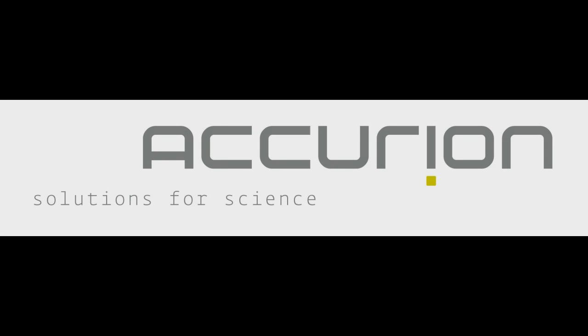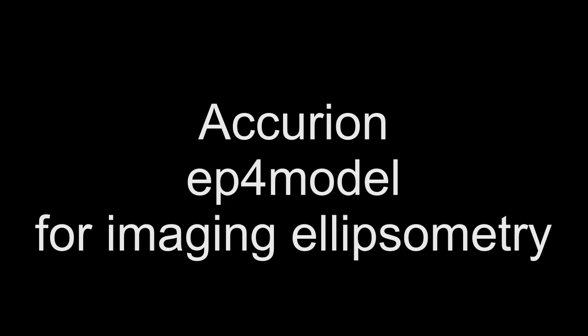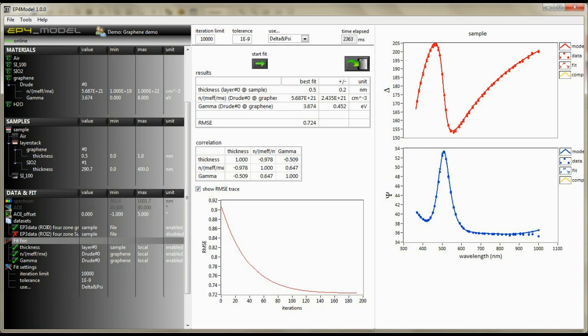Introducing the new EP4 model from Acurion, a powerful modeling software tool for calculating ellipsometric data to thickness and material-specific dispersion parameters.